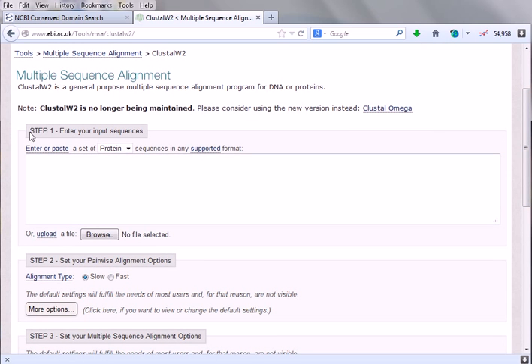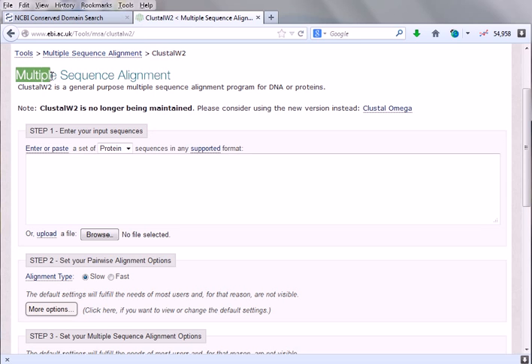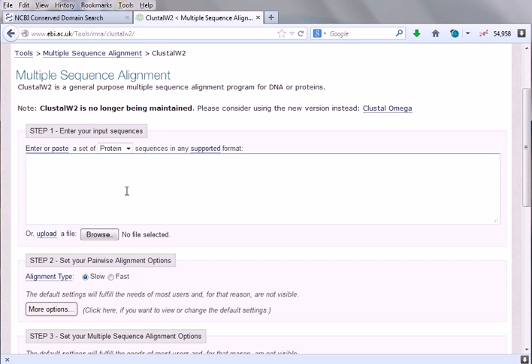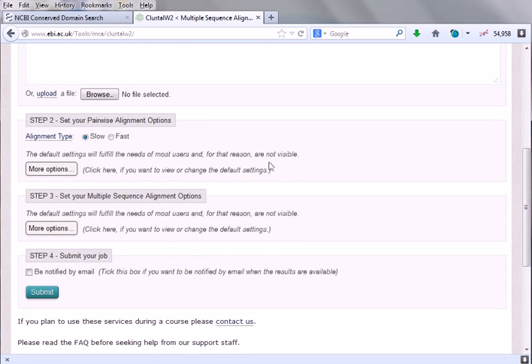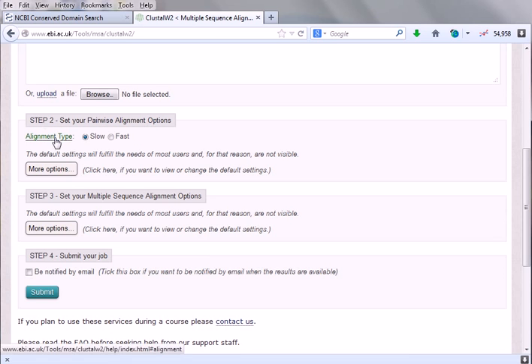There is a step-by-step process. Step one is enter your input sequences. Remember, multiple sequence alignment requires you to provide multiple sequences. So we'll be entering our sequences. Suppose we are having 10 sequences, we'll enter 10. If you are having 100, we'll enter 100. No matter how many, we enter here. Then set your pairwise alignment option.